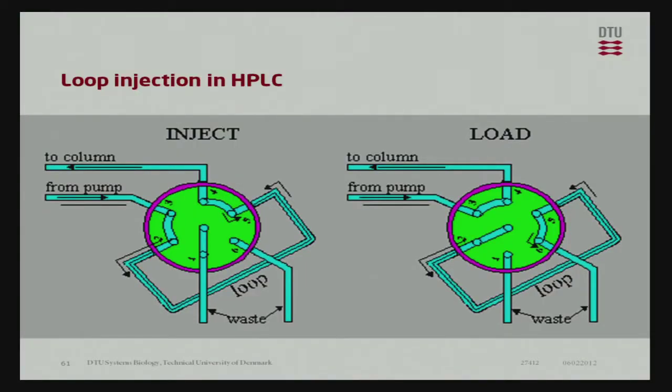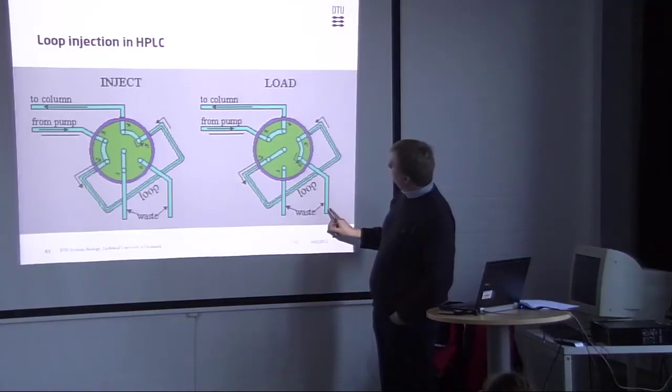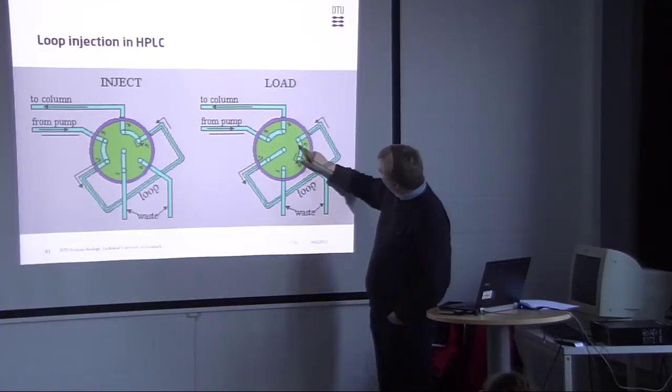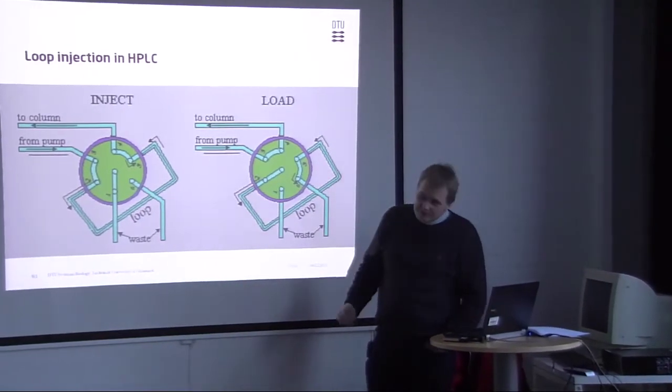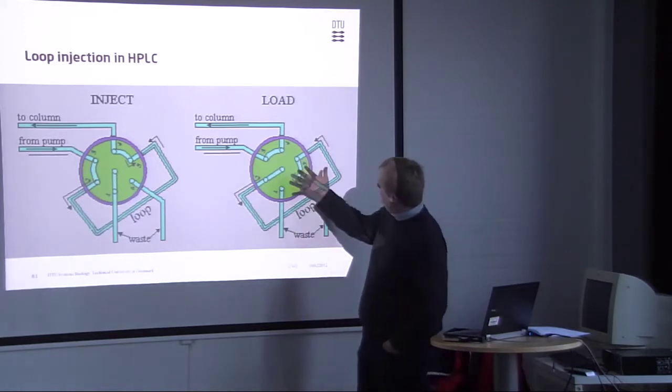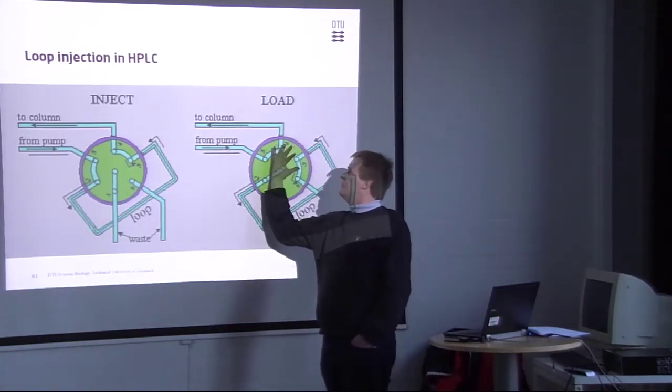So, that's mixing the solvents. So now, this was here, and now we can go, now we actually like to put the sample onto a column. How do we do that? So, usually we do this with this loop valve. So, this is how it's starting to do. So, just now we are conditioning our column, everything is ready. What we can actually do then is to inject our sample. It fills up a loop here, and you can maximum fill the whole volume of the loop.